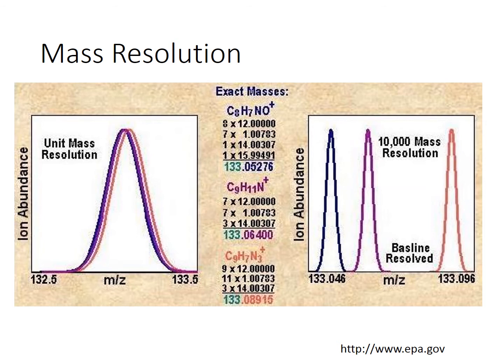There's this issue with mass spectrometry, in that all it measures is basically the mass to charge ratio. Usually almost everything will have a charge of 1 or 2, so that's pretty fine. But it doesn't tell you what element you're looking at, or what molecule, for instance. This is more of a problem in molecular mass spectrometry, where you're measuring ions of molecules, but it's also a problem when measuring elemental stuff: some elements have masses that are the same as other elements, so it's very hard to distinguish them apart. And also some molecules have the same mass as other elements.